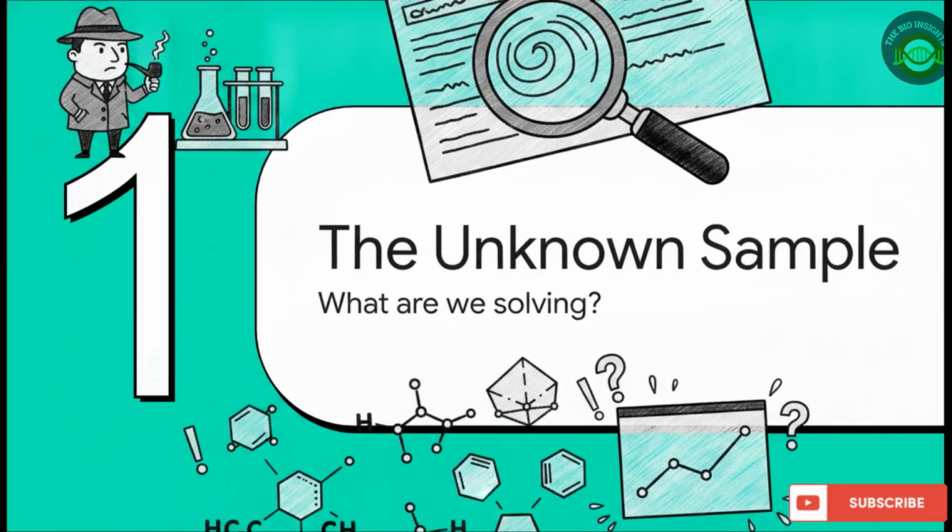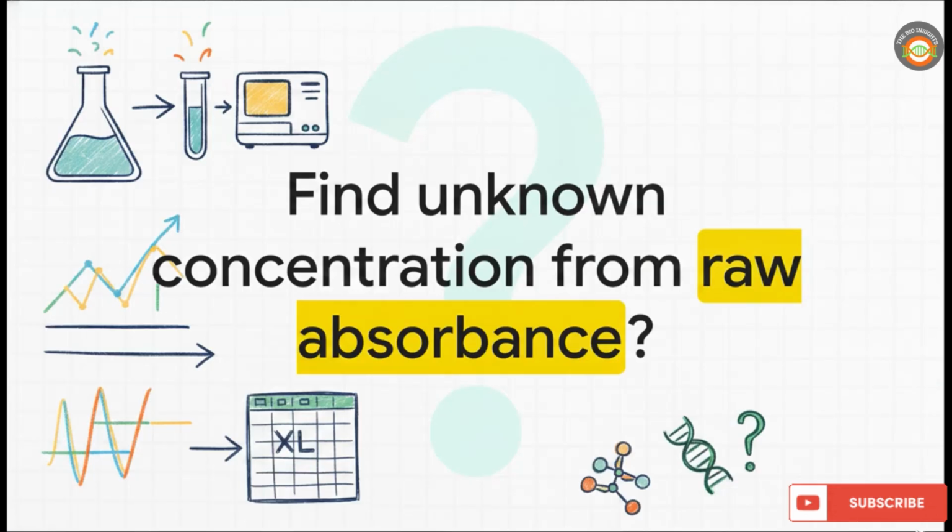Okay, part 1, the unknown sample mystery. What exactly are we trying to solve here? I want you to think of this as a sort of detective story. Your lab equipment just handed you a major clue, a raw optical density reading straight from the spectrophotometer. Maybe it's 0.428 or maybe 0.76. But, what does that actually mean? Because without context, those numbers absolutely do not tell you the actual concentration of protein or phenol in your test tube. So the big question is, how do we find an unknown concentration from a raw absorbance reading?